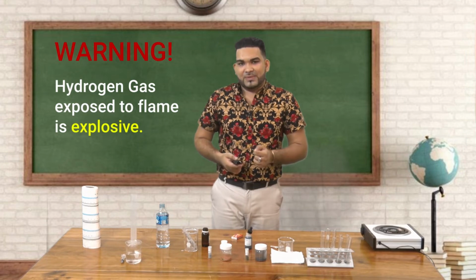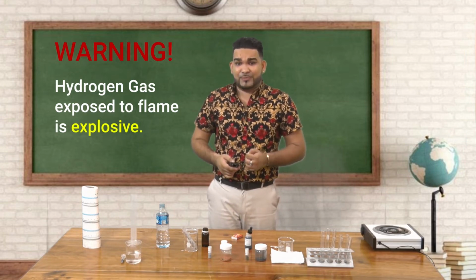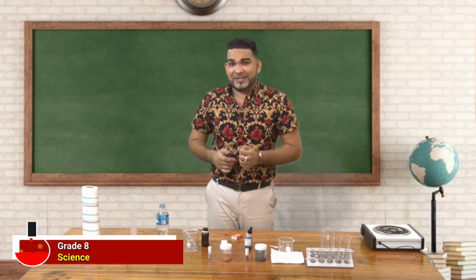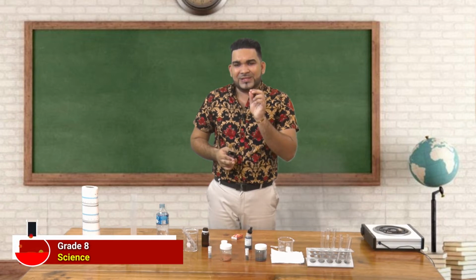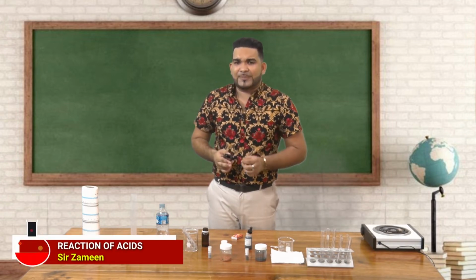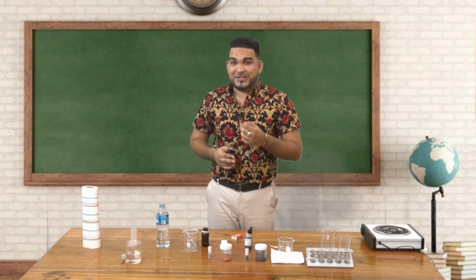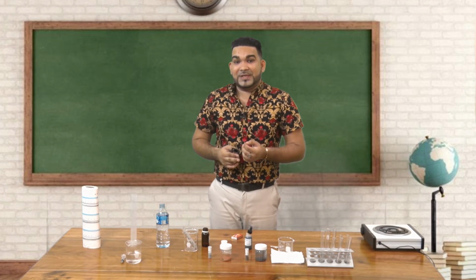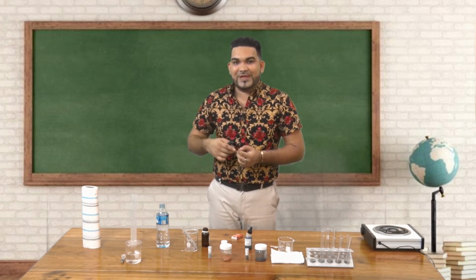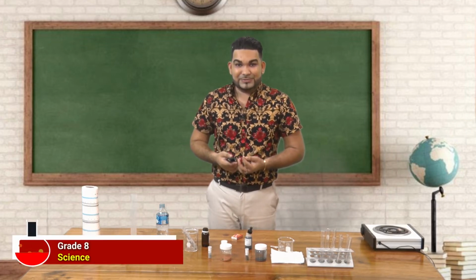Please note, boys and girls, be very careful as hydrogen gas exposed to flame is explosive. What we did here today, we just used a little bit of magnesium and just a few drops of sulfuric acid. And that is why I was able to use my matchstick, right? Because if we had used it in a large quantity, this would have been very, very harmful, as it would have caused an explosion. So please take note of that.